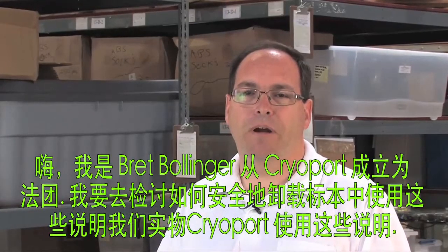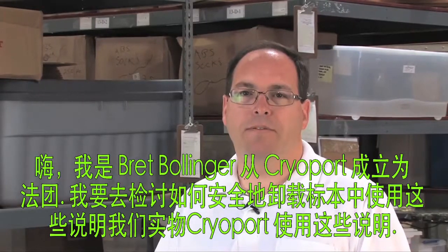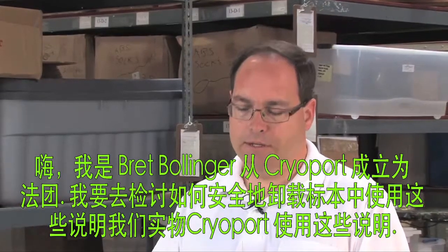Hi, I'm Brett Bollinger with Cryoport Incorporated. I'm going to be reviewing how to safely unload specimens from a Cryoport Express shipper using these instructions.